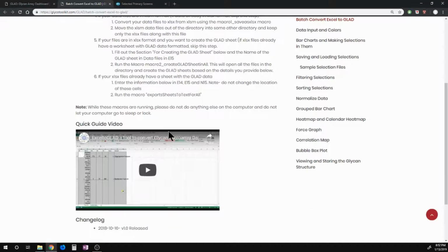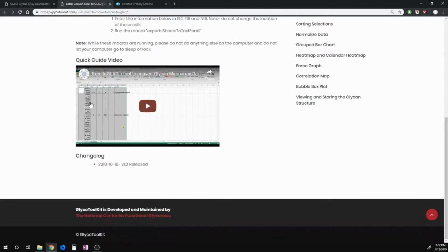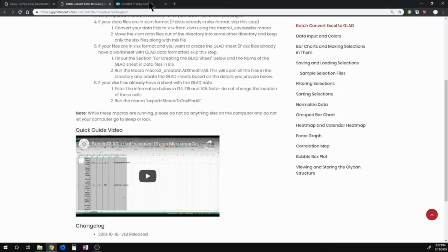Now, if you want to know more, there is a video for how to convert the Excel data to GLAD on this page. And you can do that following the video instructions.